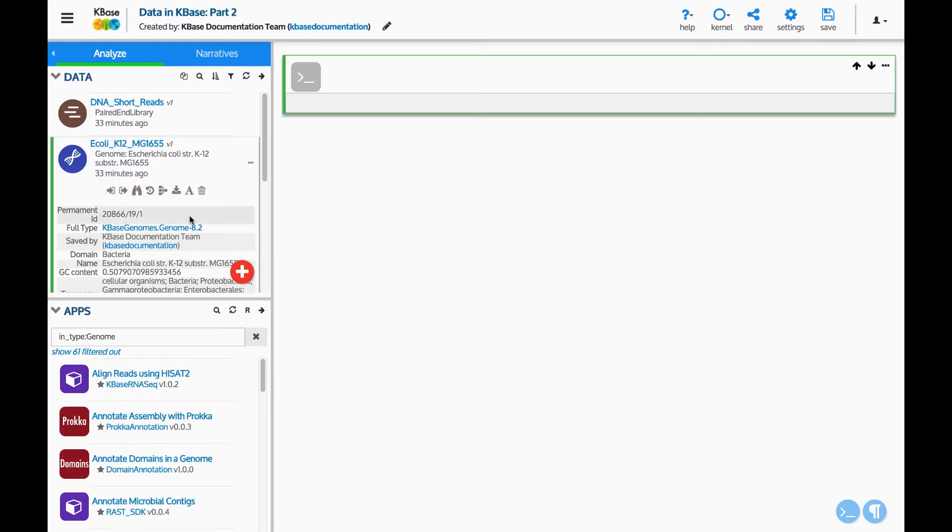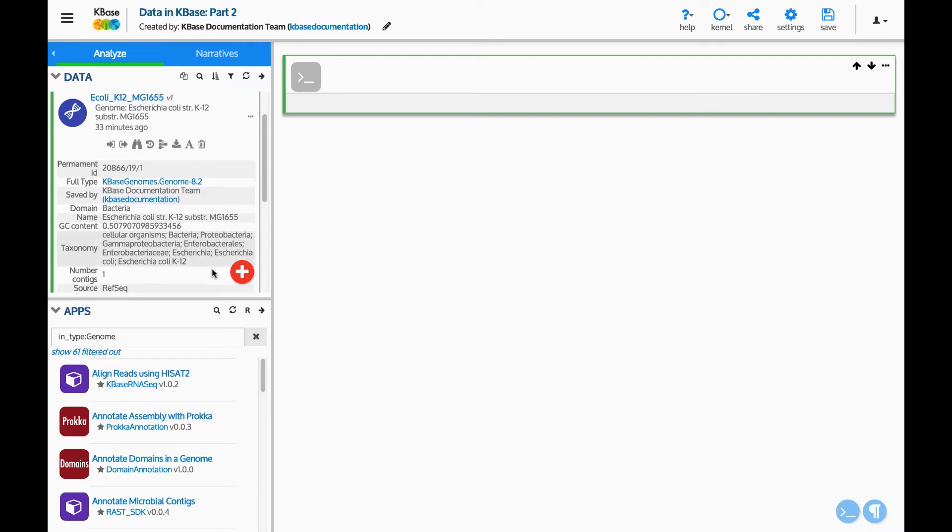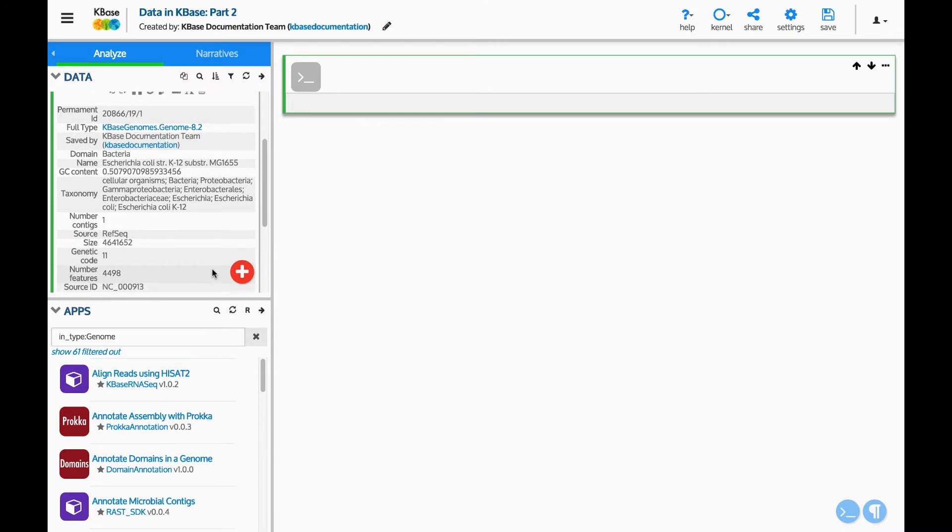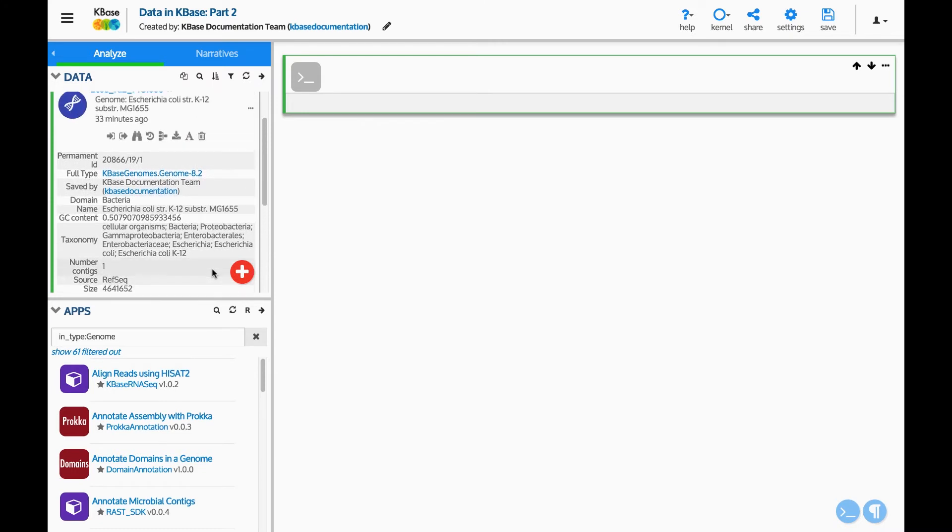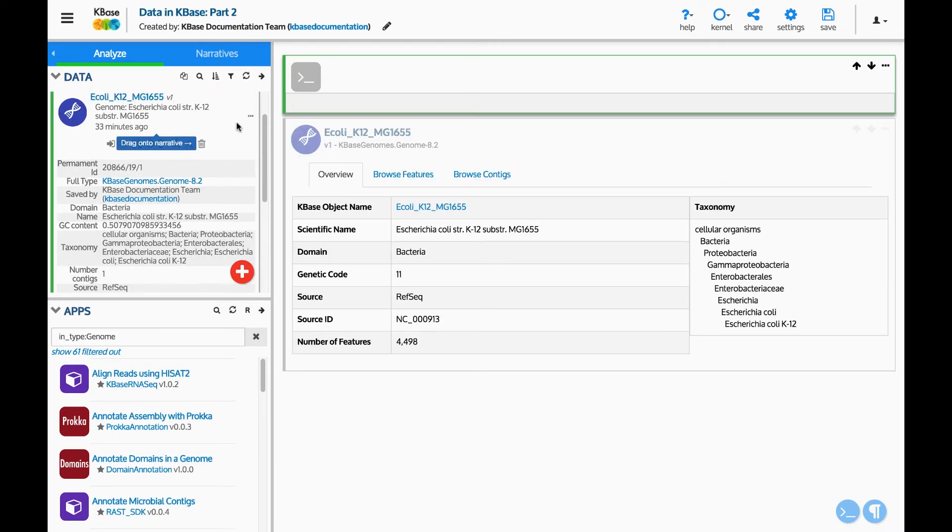Below these buttons is some information about the data. This will vary depending on the type of data. If you click on the name of the data, it will add a cell to your narrative showing more information.